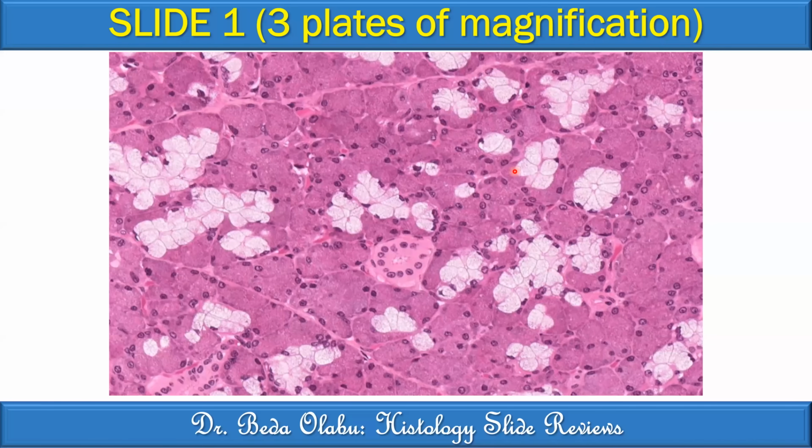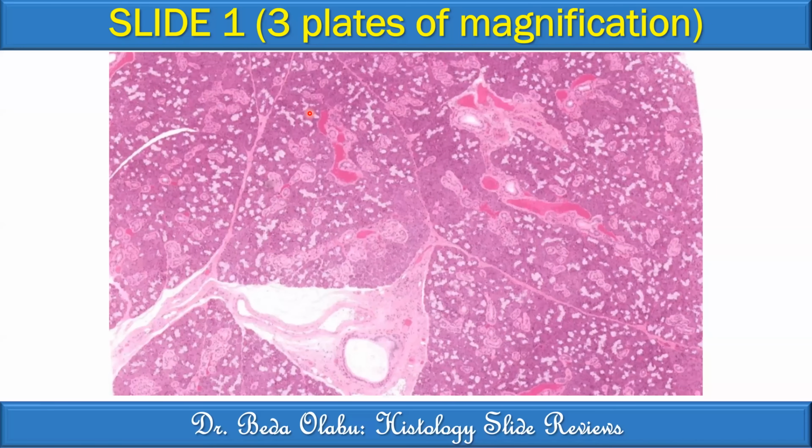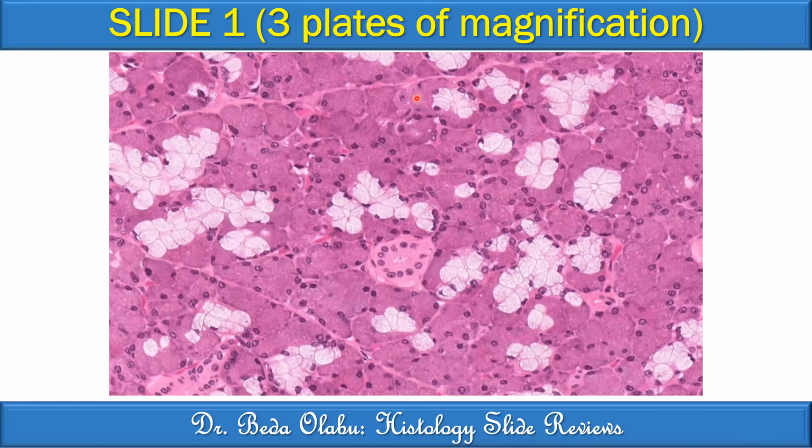The first one was that when you gave us the other magnification, I was able to tell that the stroma was dividing the slide into lobes because I was able to see. And then when you now gave us this one, I can see that the stroma is running and dividing the slide into lobes. And then when you gave us the other magnification, the one that you just removed, I was able to see lobules.